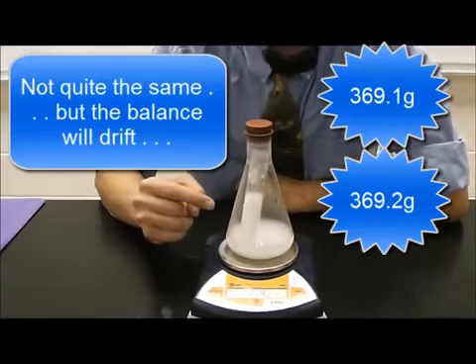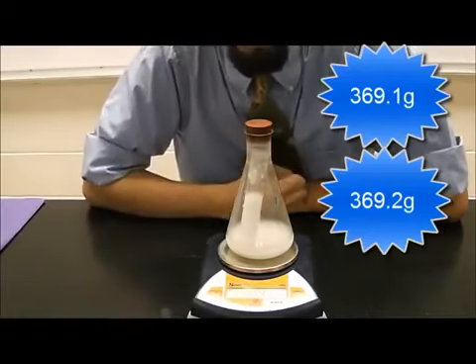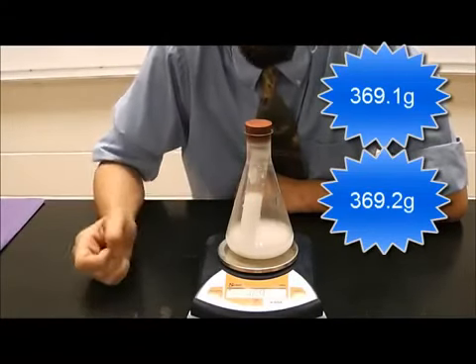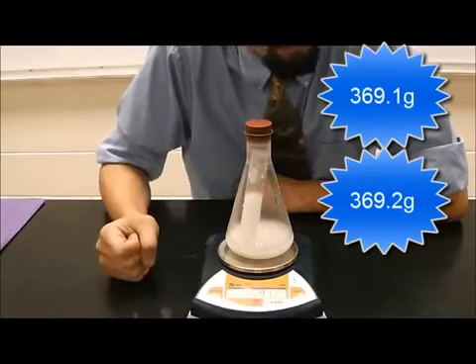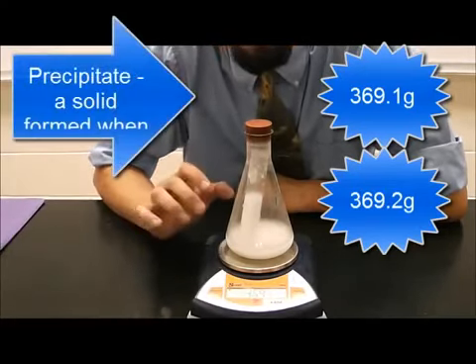Now, the way that I know a chemical reaction happened here is because of two things. Number one, I have a color change. It went from a clear solution to a white solution. The other thing that it's telling me is that it's cloudy. So I now have a precipitate that has formed.